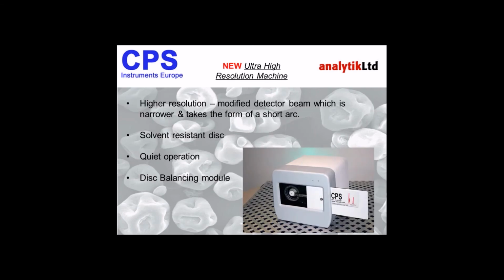Okay, so far I've only talked about the technique. I'm just going to finally show you a typical instrument that can be used for doing analysis with differential centrifugal sedimentation, and this is the CPS disc centrifuge.